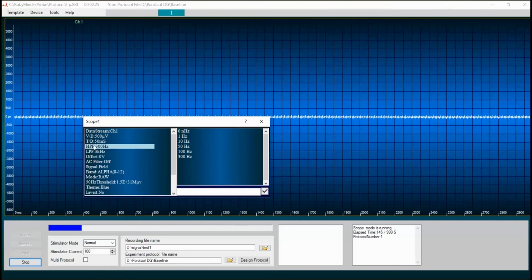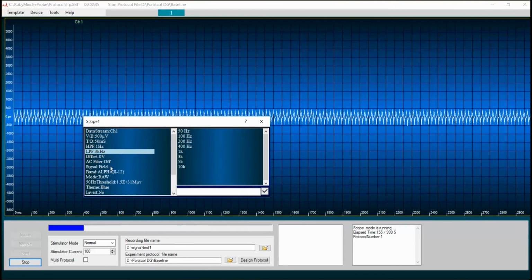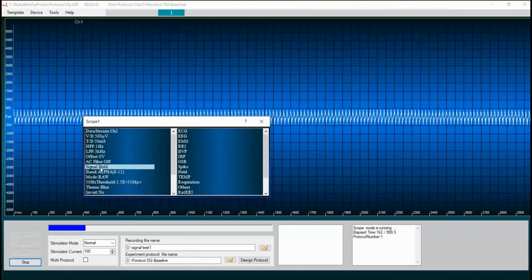Now, we want to record an LTP as sample. I set HPF to 1 Hz and LPF to 3 kHz. The other settings are not defining for this task, but only for human recordings. The only remaining factor is signal.